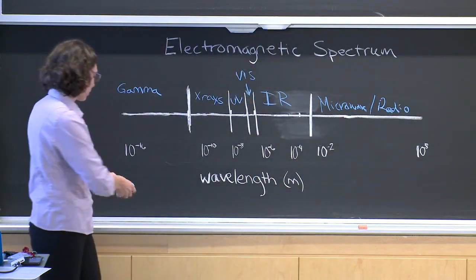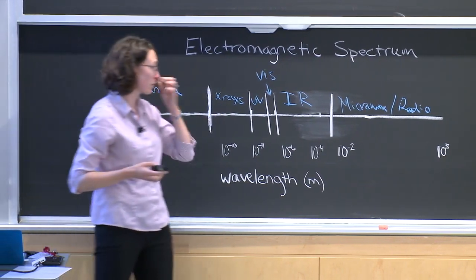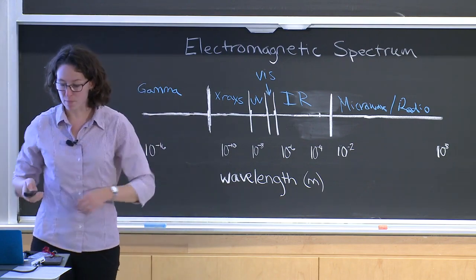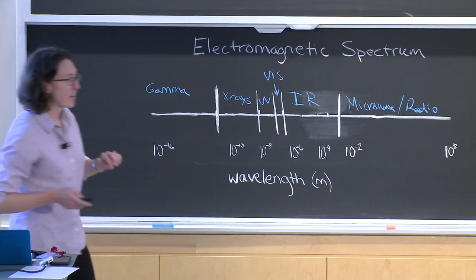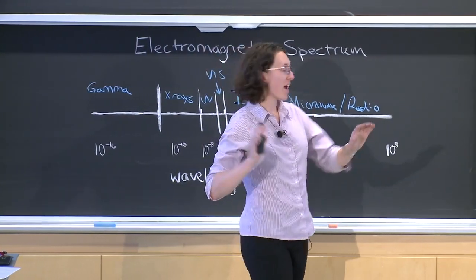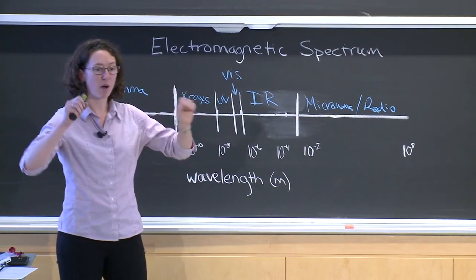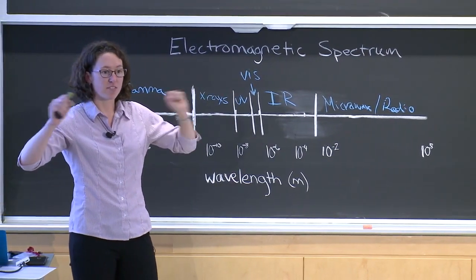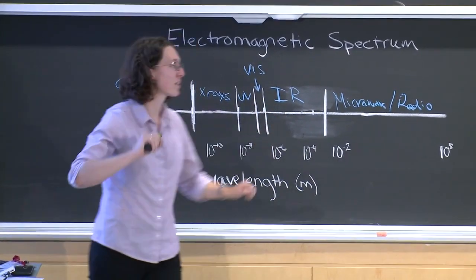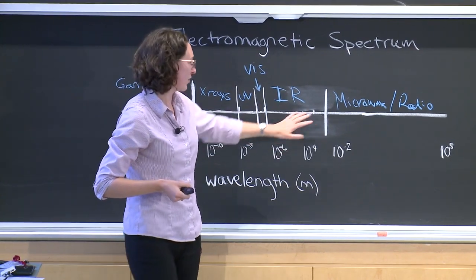All right. So from highest energy to lowest energy, this is our electromagnetic spectrum. And so IR spectroscopy uses IR radiation to give us information about a molecule. And the way that this happens is that it's very useful for identifying functional groups in a molecule. And you pass this IR radiation through the molecule, and all of the bonds in your molecule have some sort of vibrational energy associated with them. They're vibrating at a certain frequency, which corresponds to energy in the IR region of the spectrum.